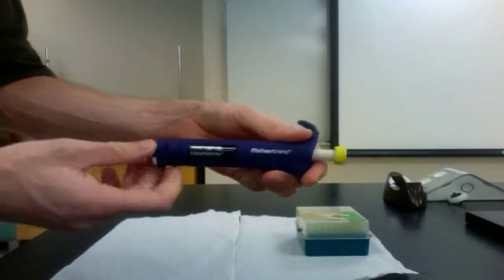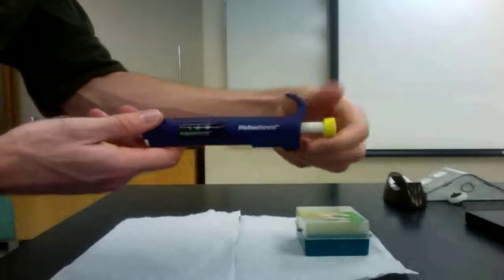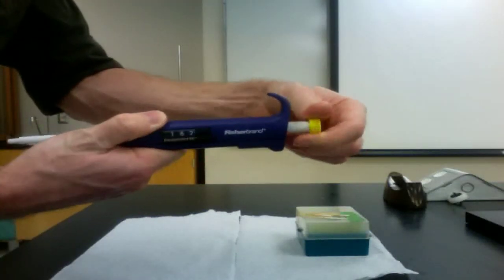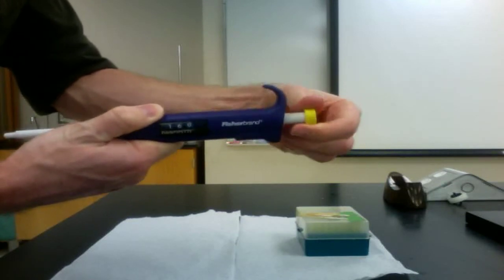The micropipette is used to deliver small volumes of liquid reproducibly. This is an adjustable micropipette in that you can change the volume delivered by simply turning the yellow knob. The numbers on the side indicate the number of microliters of solution delivered.